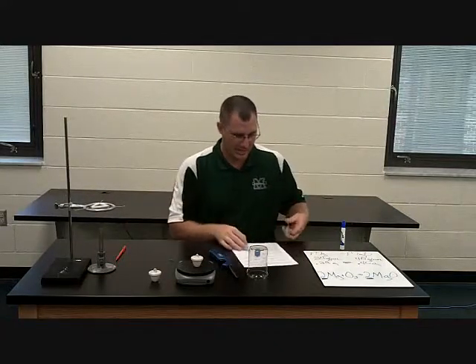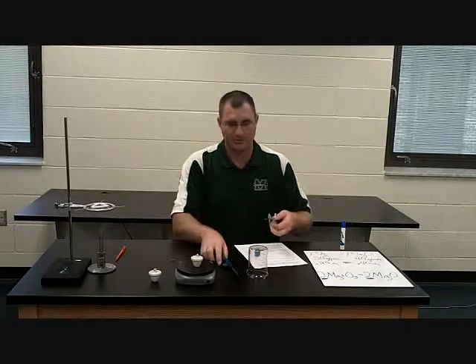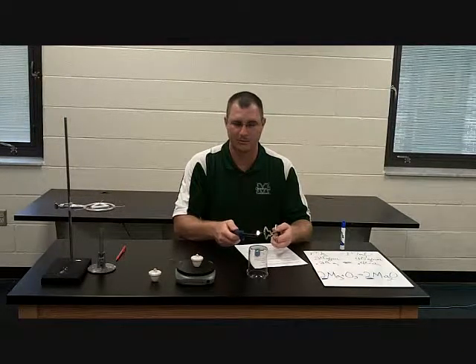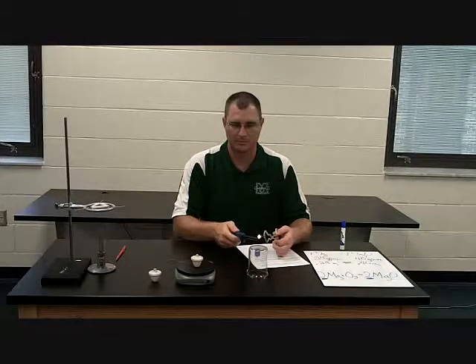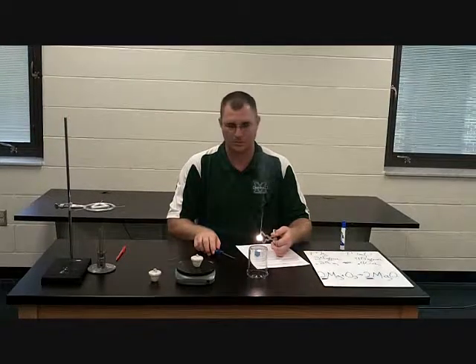Now, after they did that, we got to burn it. And when you do this, you have to be careful and not look directly at it, because it burns bright enough it'll actually hurt your eyes. So you just kind of want to look at it out of your peripheral vision. So as soon as I get it going here, I'll kind of look away. I'm anxious to see how this goes on camera. Woo, man, that's bright. That is really bright stuff.